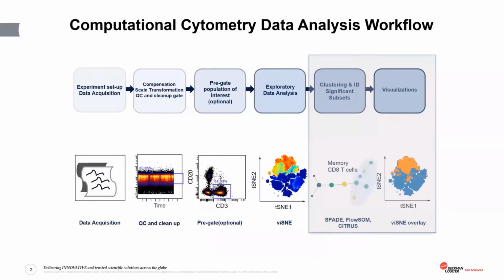In the first 3 webinar sessions, we've gotten started with this recommended data analysis workflow to help you get the most out of your data. We already reviewed how to quality control and clean up your cytometry data, do any gating that is needed if you know you're interested in any specific populations, and beginning exploratory data analysis with viSNE.